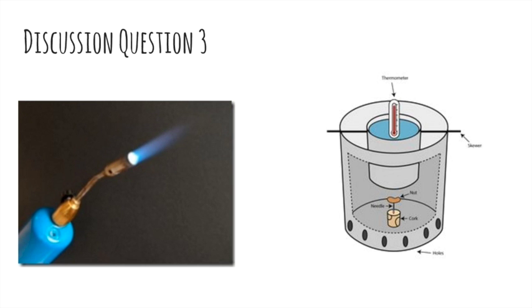If we could have done something different in this lab, we could have done quite a few things. The first improvement is we would have spent more time researching and designing our calorimeter. We went into the lab with minimal knowledge of how to make an efficient calorimeter, and we kind of winged it. We only spent about 30 minutes designing and constructing our calorimeter, which we regret. With more research on how to insulate calorimeters, what makes them the best conductor, and how to channel the heat into the water efficiently, in retrospect, we would have been able to construct much more accurate devices.